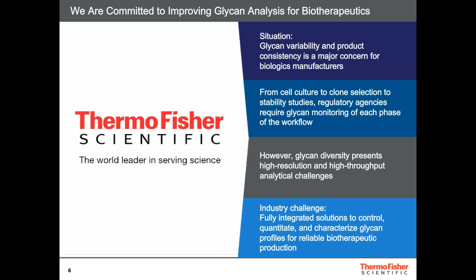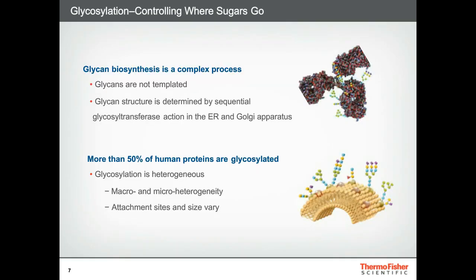Protein glycosylation is one face of product quality, but it can affect structural and functional characteristics of an expressed protein. This can have profound impacts on in vivo half-life, efficacy, ADCC activity, and clearance rates. The example of glycan structures on the bottom right demonstrates complicated structures that can contain many branching sites. This leads to problems in sequencing or determining the glycan structure. By comparison, DNA and proteins have linear structures, which are relatively easy to sequence.